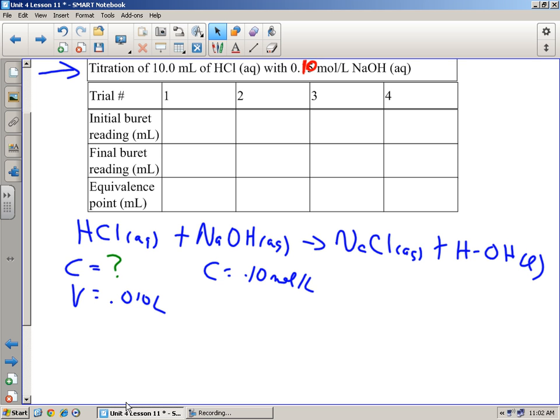We're going to stop. See, it's turning pink, so I want to stop when it starts turning pink like that and just swish it up and it goes away. I'm getting probably a little bit close here, I would say. Okay, when it starts to turn pink like this, it's going to be fairly close. Notice I'm not looking at the numbers right now. I don't care about that. You need to get the end point, right? That sudden change in color. Ooh. Okay, well, there you go.